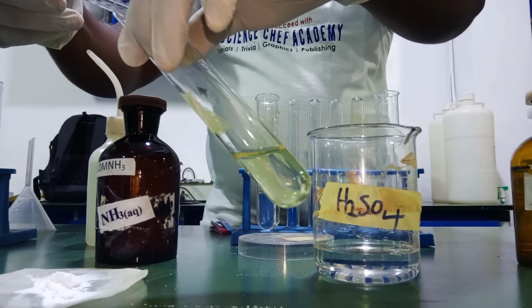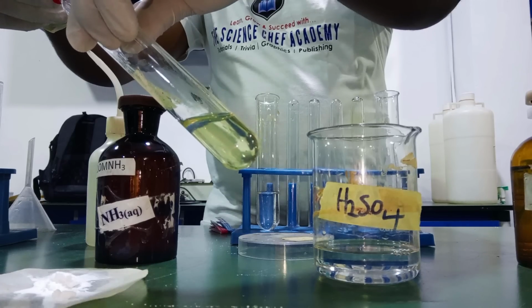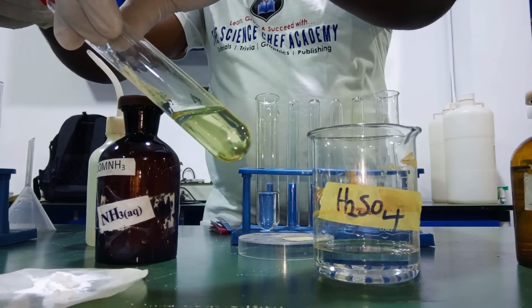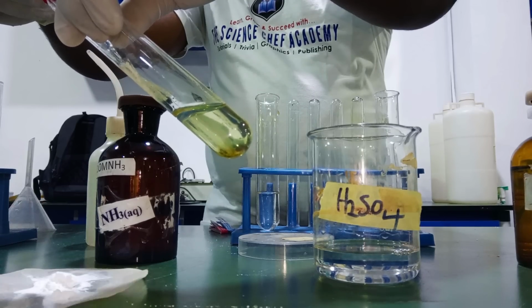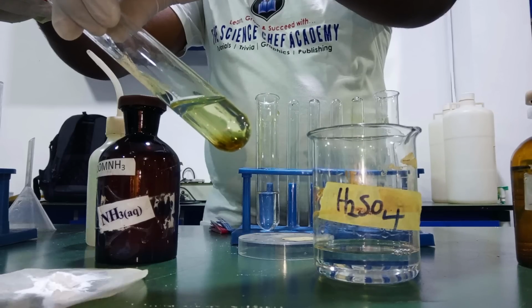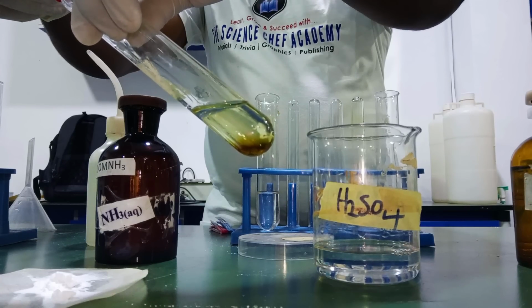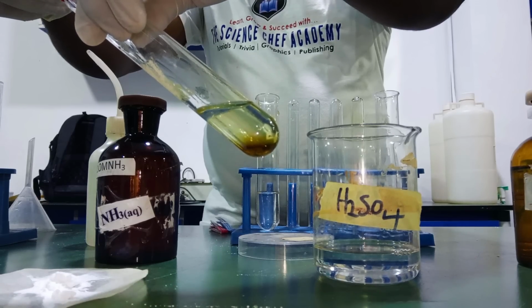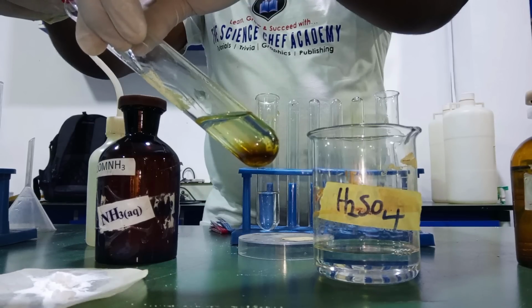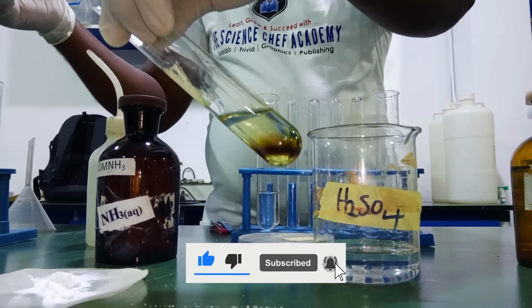Slowly down the side of the test tube. Look at the test tube. Can you see the brown ring that's beginning to form at the bottom? Can you see it? You add it gently. Can you see the brown ring there? That confirms the presence of the nitrate ion. Can you see the brown ring?